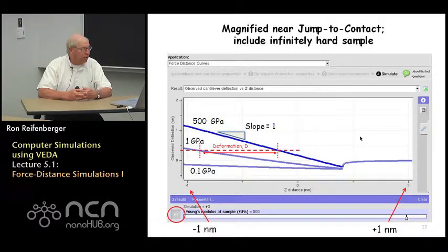For the simulations of softer substrates, you can see that there's a distinct deformation, and you can, in principle, read that deformation off from this plot by referencing the red fiducial marks that I've added to the plot. The wording on this particular simulation is something that I've added after the fact. Hopefully it makes it a little bit simpler for you to understand the plots. I'll just mention that you don't have to measure the deformation from these plots.